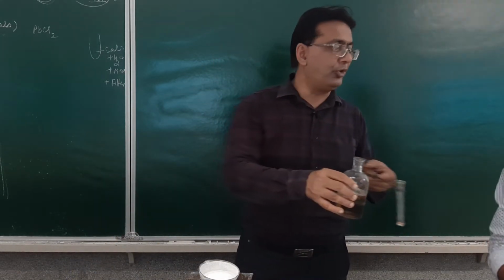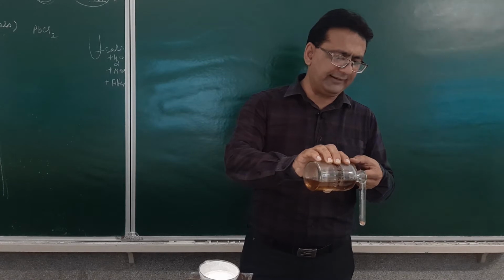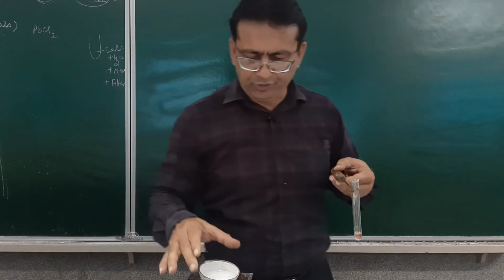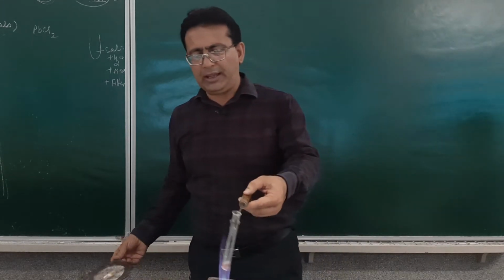When I add the concentrated sulfuric acid, you may again see, students, how I carry out this test. We heat it again.